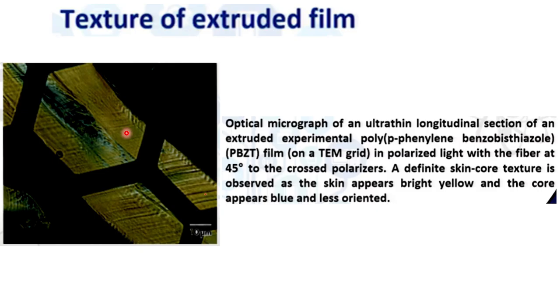So this yellow color is the skin of the extruded film, and this blue color in between is basically the core of the film.